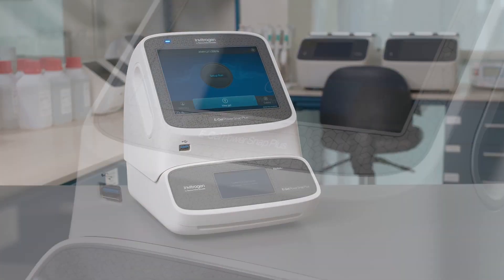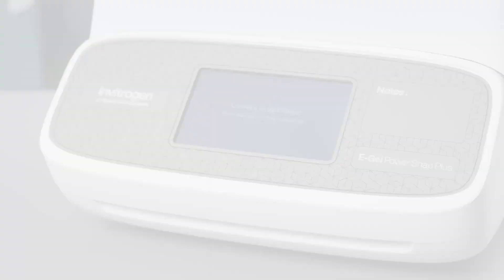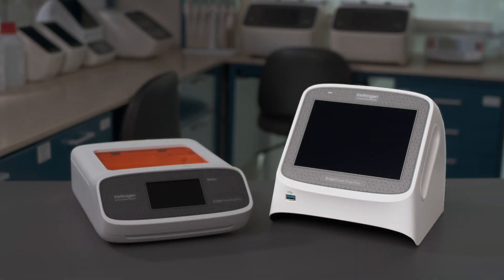Setting up the Invitrogen eGel PowerSnap Plus electrophoresis system is simple. The system consists of an electrophoresis device and a camera module.